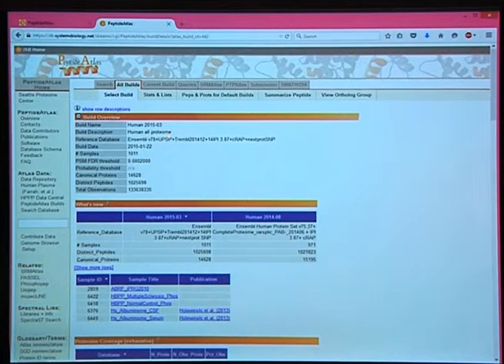The Swiss-Prot component of human is just over 20,000 proteins; with TrEMBL and Swiss-Prot and the varsplice isoforms, it's on the order of 57,000 or something like that. But we then map it to all these different databases. This neXtProt SNP file is interesting. Earlier we had a question about SNPs.